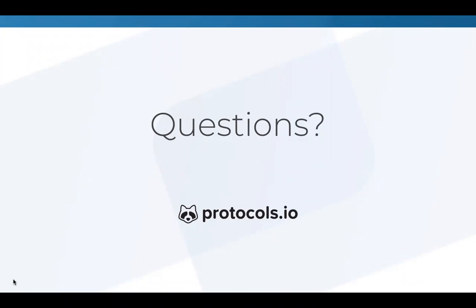Right, so that's a really good question. And what we have done at protocols.io is we separate the authors from the contact person. So if you're finding somebody's protocol and using it, but you didn't develop it, you could put yourself as the contact person because you're currently working with that method, but you can put whoever developed it, if you know who developed it, as the authors. And so that's how you can do it.